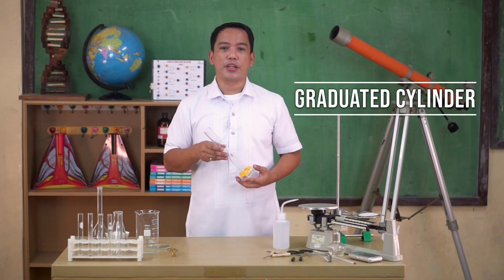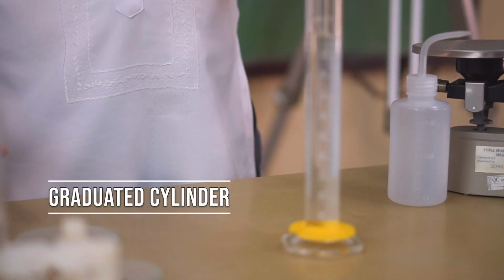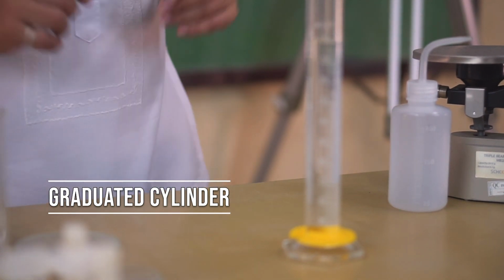Graduated cylinders are used for measurement of an amount of liquid. The volume of liquid can be estimated to the nearest 0.1 mL with practice.